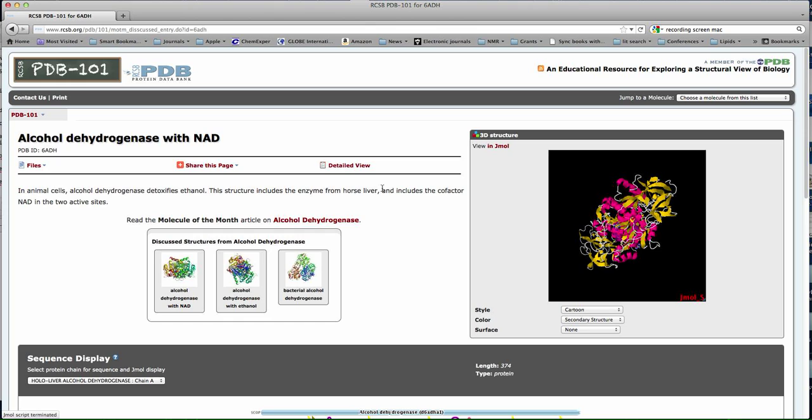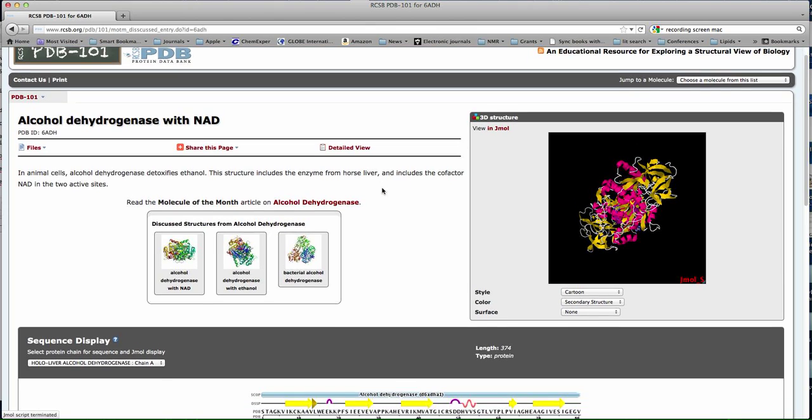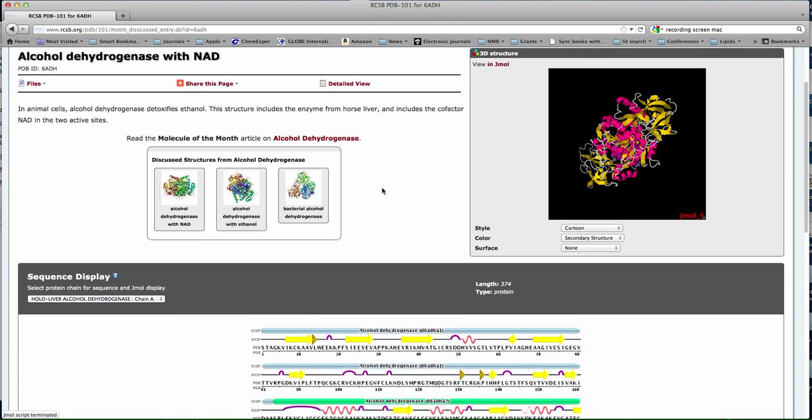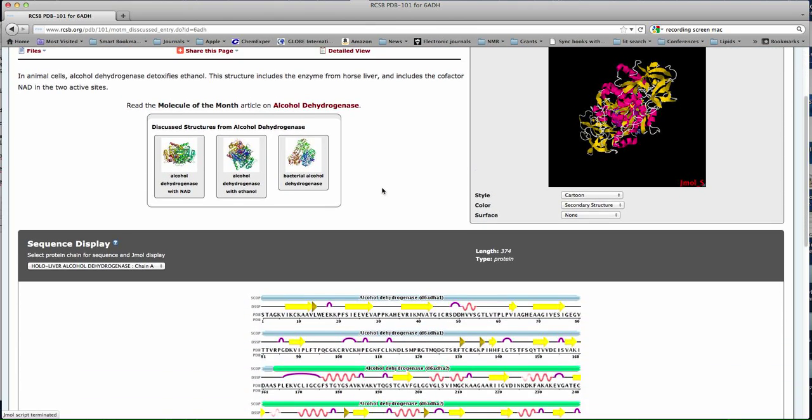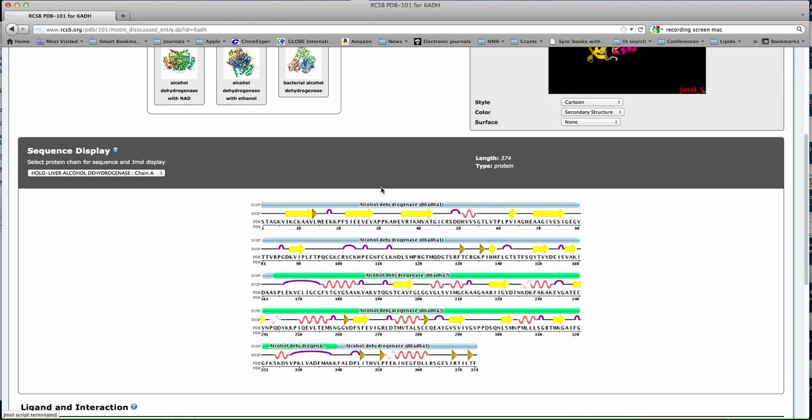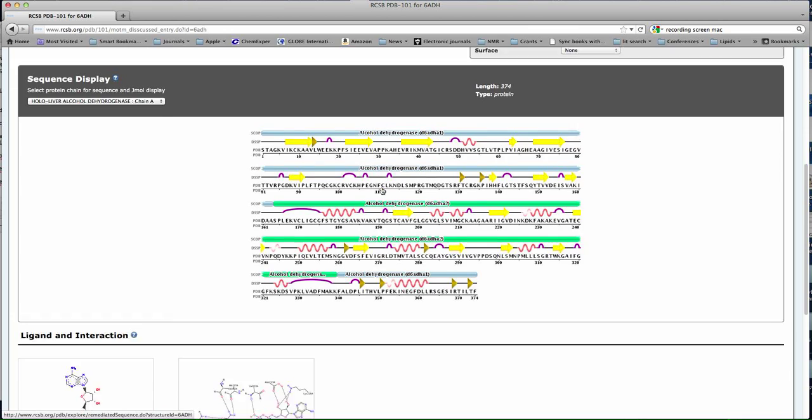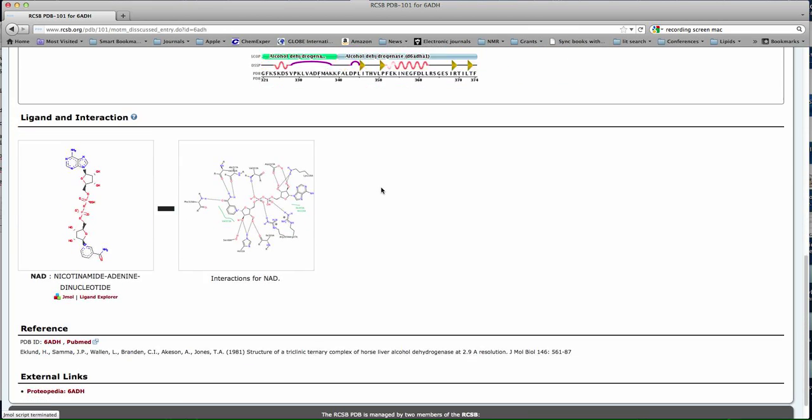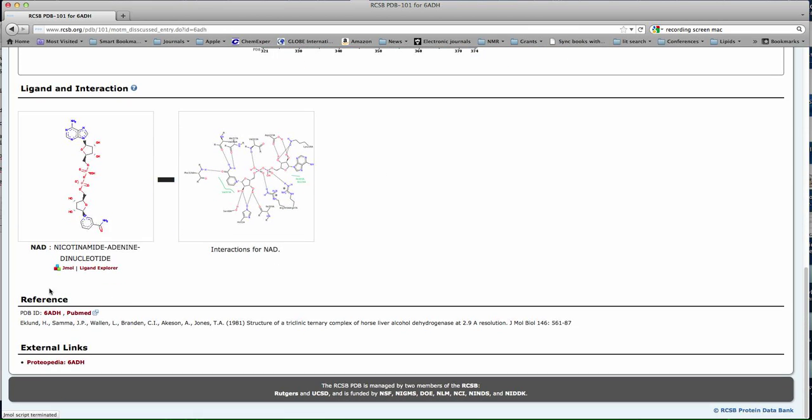But what I want you to do now is find the PDB ID. Now that's down here at the bottom. They always look like this, four letters and numbers together. We need that ID when we come to look at the protein in Pymol.